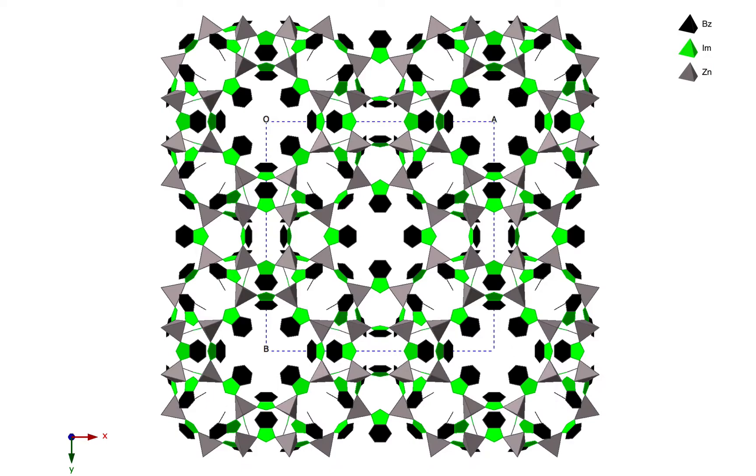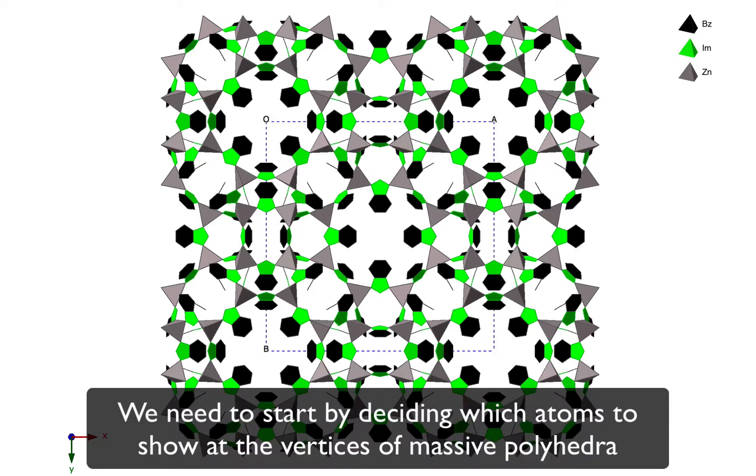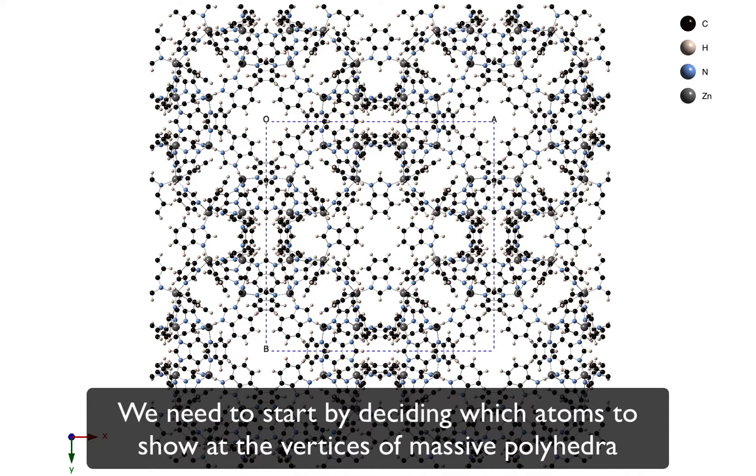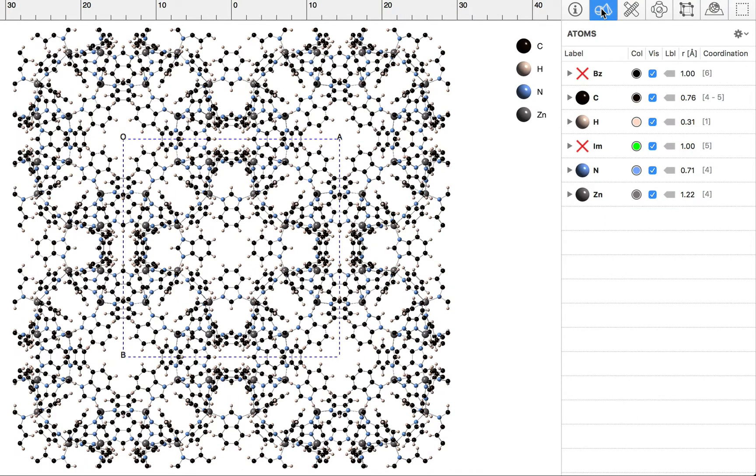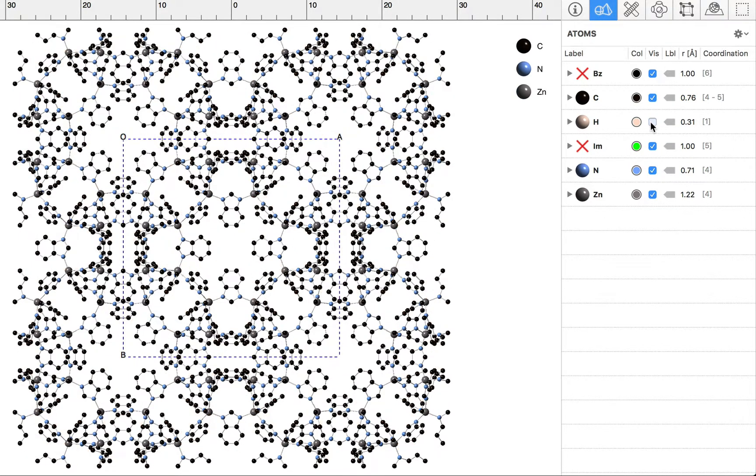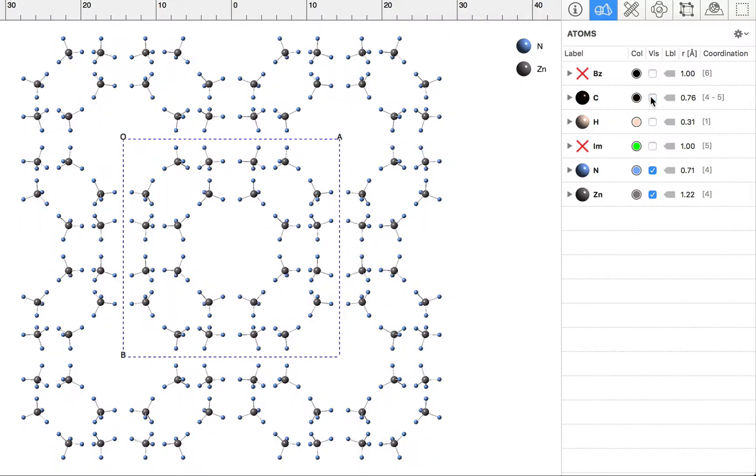What we need to do is take a cool detached look at this structure. I'm going to start by going back to a ball-and-stick model, go to my atom inspector, and hide all of the non-essential atoms, starting with hydrogen. We'll hide some of the dummy atoms in the structure, and we're now going to hide carbon. Now with just nitrogen and zinc visible we're starting to see some kind of pattern.